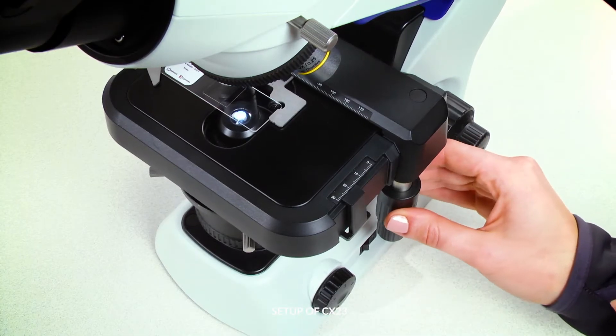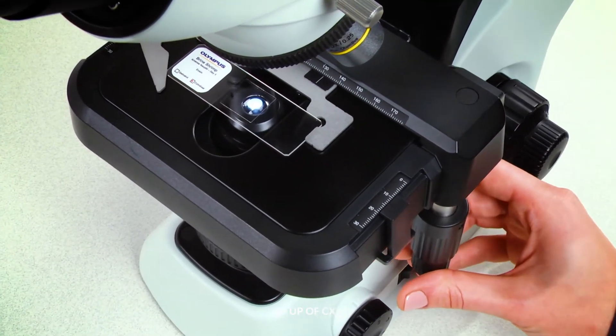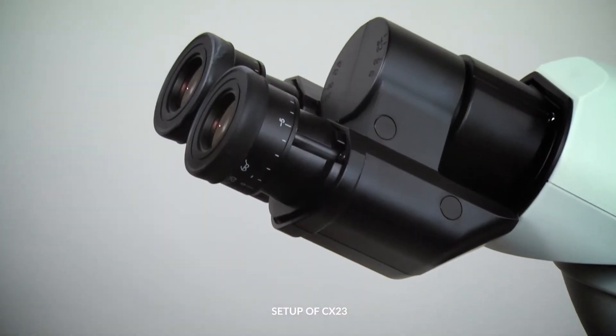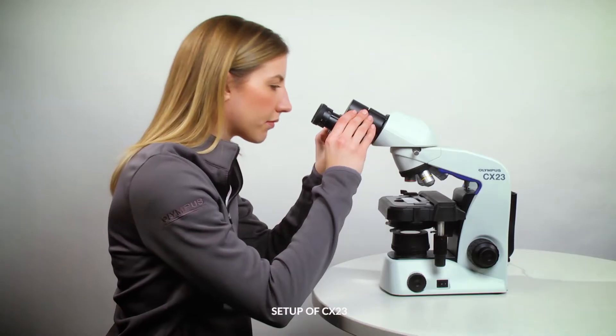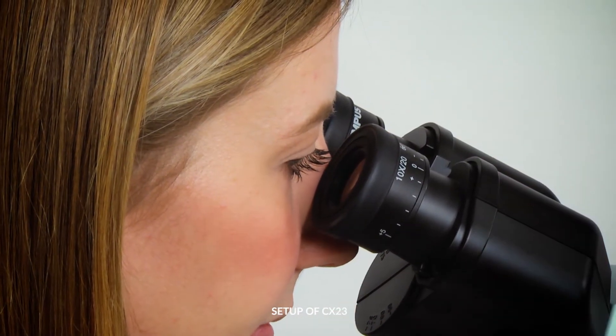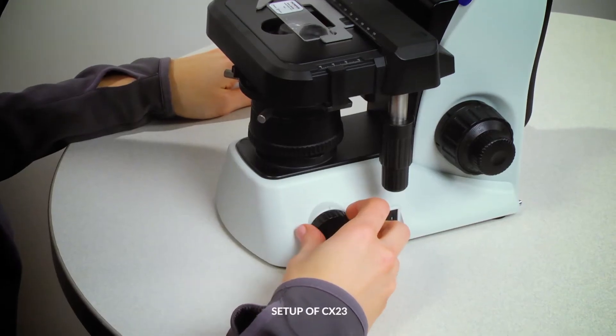To properly set up the CX-23 microscope, use the X and Y axis knobs and move the stage so the sample is in the light path. Adjust the eyepiece's interpupillary distance by gently holding the binocular eyepiece in both hands and tilting it up or down so they fit nicely to your eyes. Look through the eyepieces and adjust the light intensity to your liking.